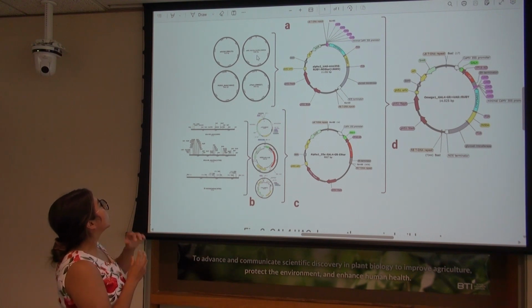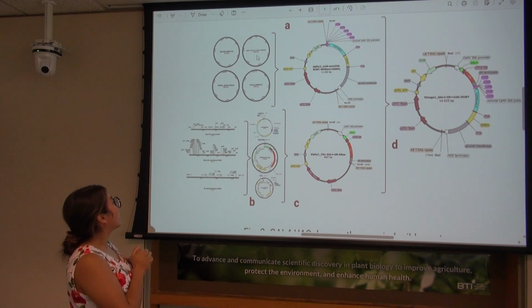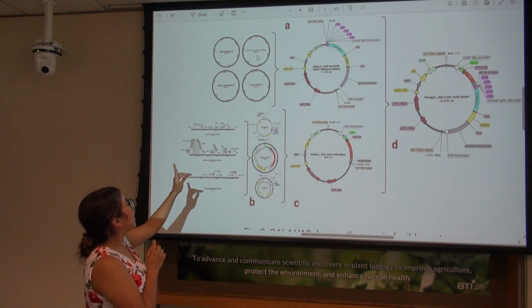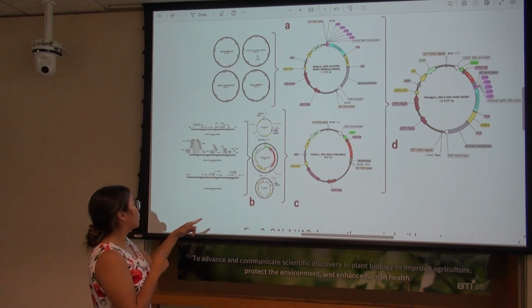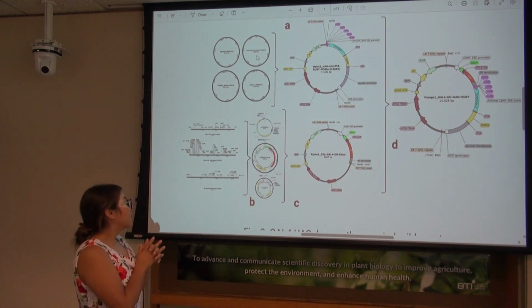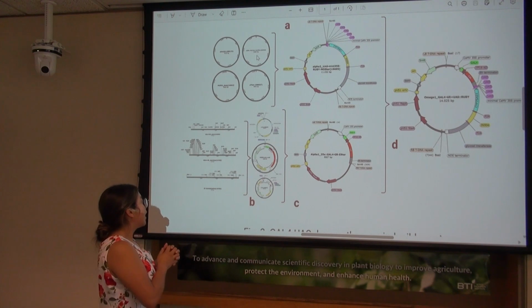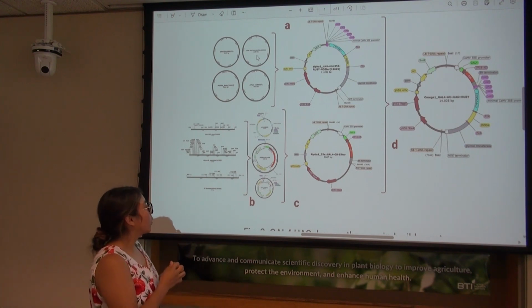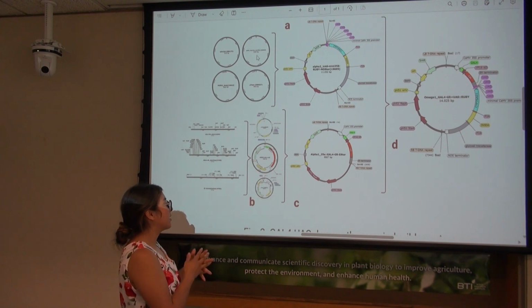So we had the UAS, we have the promoter Mini 35S, we have also our construct Ruby, and our terminator in that part. But here in NB we had the GAL4 system. So we had two parts which were domesticated to put them into this plasmid. And after doing that, we made golden braid into alpha 135S.